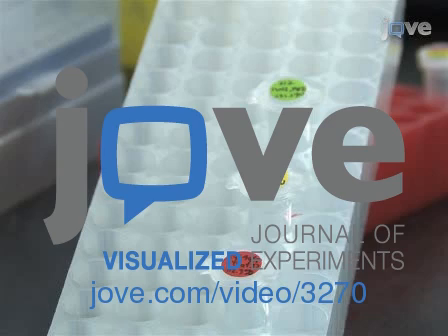Now screen the worms for the selected phenotype. Pick single F1s with the observed phenotype to a new seeded plate and store at 25 degrees Celsius. Finally, for transgenic lines, transfer single F2s into individual plates. Store subsequent generations at 20 degrees Celsius.